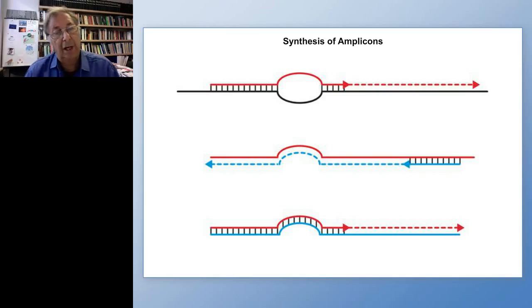And so the purpose of this slide is to illustrate the point that the selective step, whether amplicons get made or not, the selective step of copying mutant templates, but not copying wild type templates that differ by only a single nucleotide polymorphism, occurs only on the template molecules present in the original sample being tested. Once amplicon gets made by a super-selective primer, then those amplicons are exponentially amplified in the conventional manner. Exponentially, 2, 4, 8, 16, 32, 64, every cycle of amplification doubles the number that are there, making many, many copies of the target.